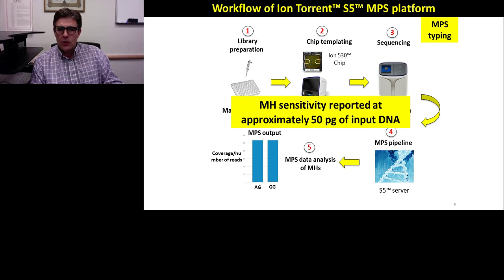Then we worked on bioinformatic pipelines to process the data, using some that were provided by Thermo Fisher's, others that we developed. And the final output, in this particular case, kind of mimics what the conventional STR analysis looks like. So we have a bar as opposed to having a peak, and the height of the bar represents how many individual reads of that particular sequence have been found.